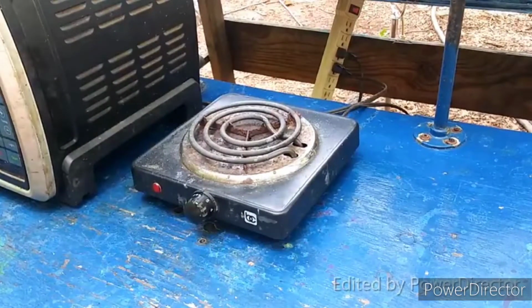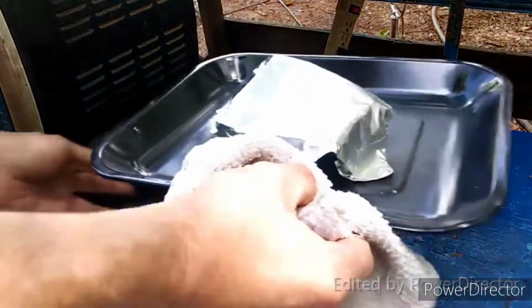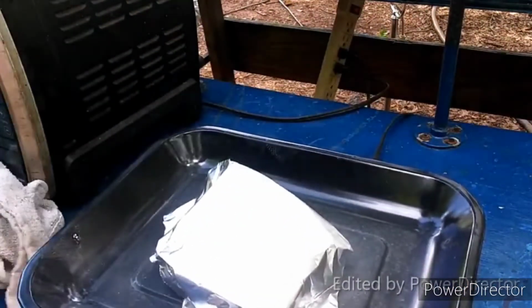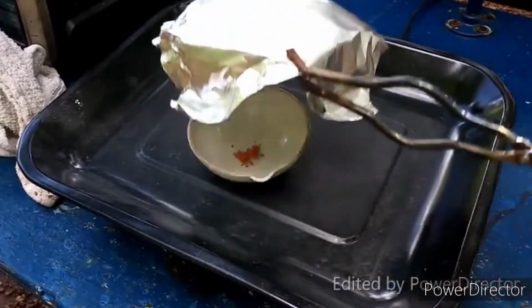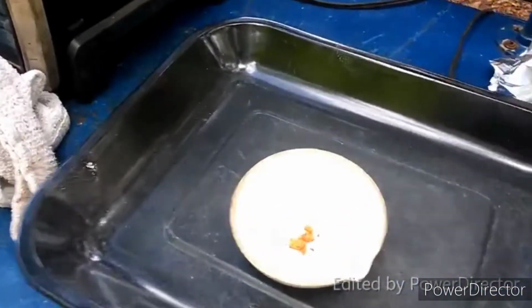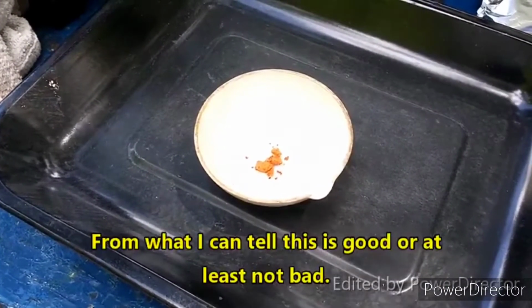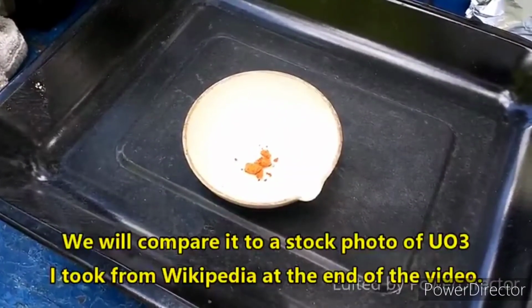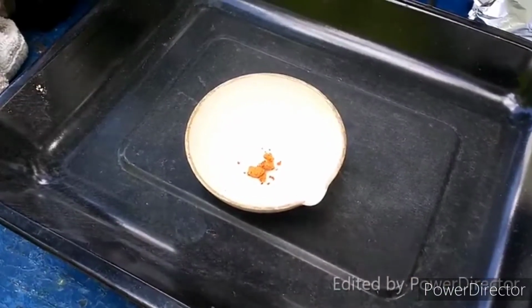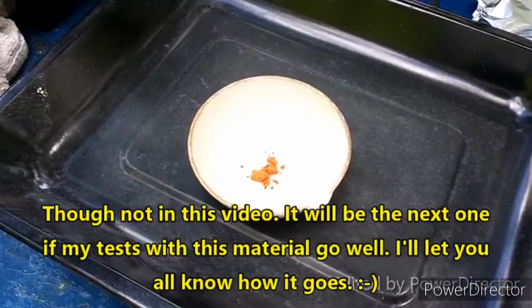All right, everyone. Our cake has been in the oven for 30 minutes. Let's take it out and see what it looks like. Yeah, that is hot. Okay, all right. Here we go. Oh, it turned kind of reddish. I don't know if that's good or bad. All right, so what I'm going to do is let it go through one more cycle, and we'll see if its appearance changes anymore. I mean, if not, we will give it a try and see if it tests like our product should.